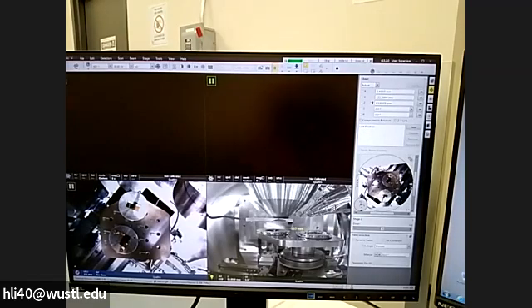Okay, so let's move on to the next thing. After you get your sample ready there, we need to start the electron beam and start observation. I'm going to show you in the next clip.